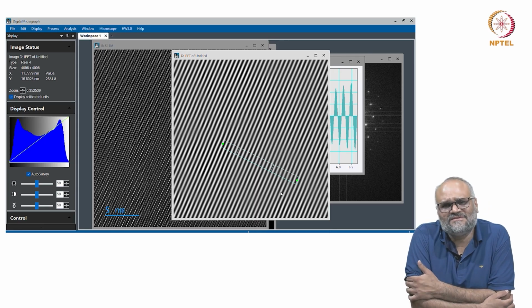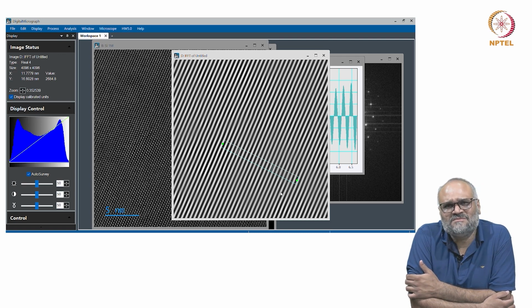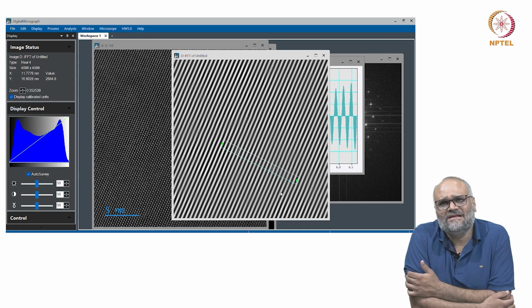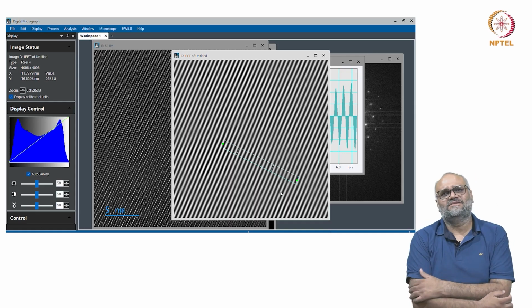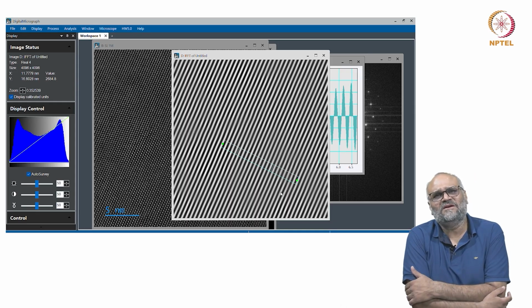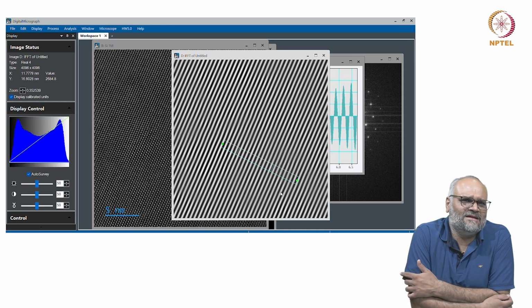And from our experience, we've seen that people end up coming saying that there is an error, I'm not getting a match between the actual expected lattice spacings and the measured lattice spacings from TEM. And also with different magnifications, people say that at 400,000x I get a d-spacing of so and so, whereas at 600,000x I get a different d-spacing.